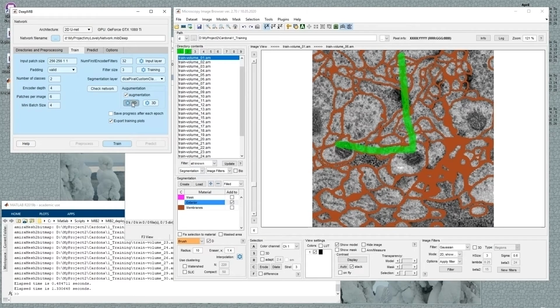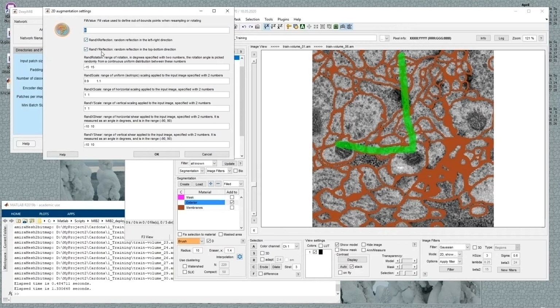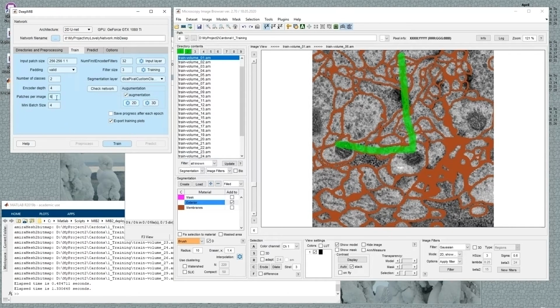And then if we have augmentation, so we have, let's say, 1, 2, 3, 4, 5, 6 different augmentations, but they go as this kind of random combination, I believe. So we can actually multiply it like 6 by 6, something like this. In this particular case, let's put here, go back 512, 512, and let's put, well, I don't know, 64, 48, something like that.